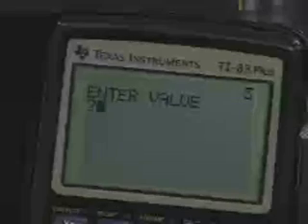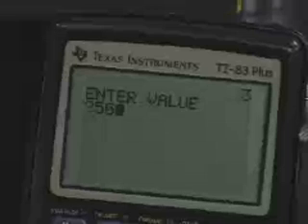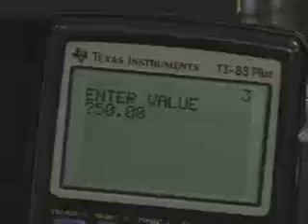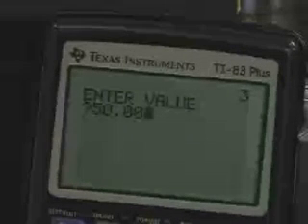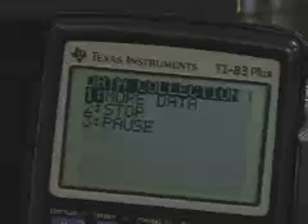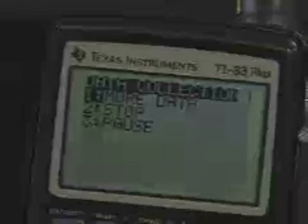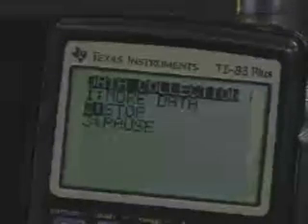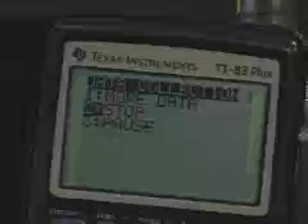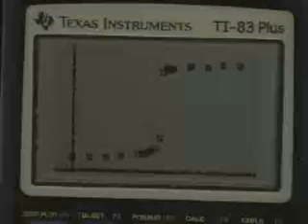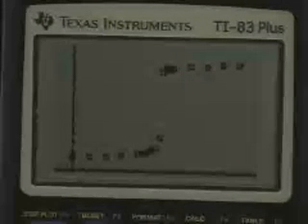When we reach 50 milliliters and the reading on the CBL is stable, press trigger, enter the value 50.00, and press enter. You're now through collecting data, so come down and press stop. This is the graph of the acetic acid with sodium hydroxide titration.